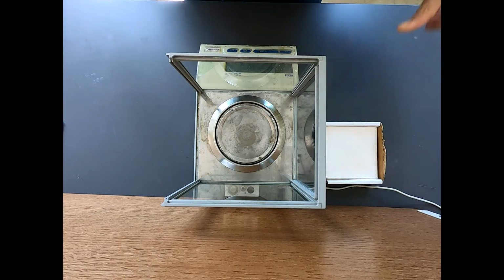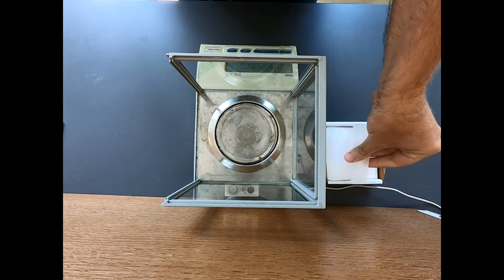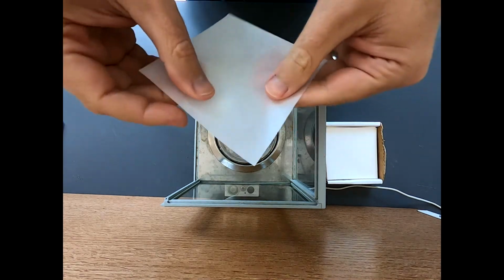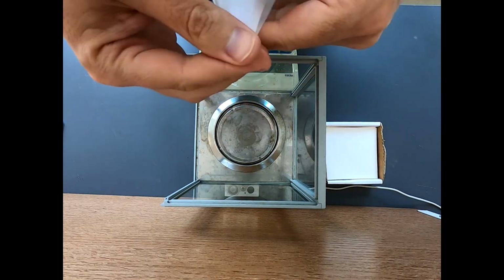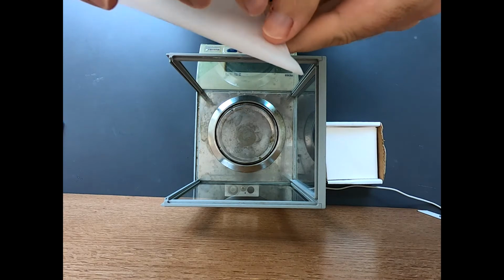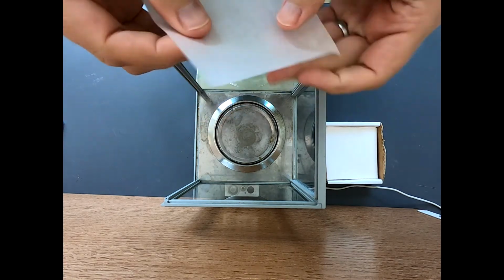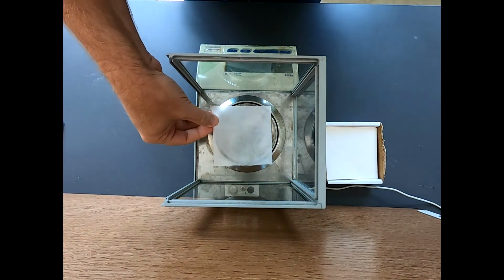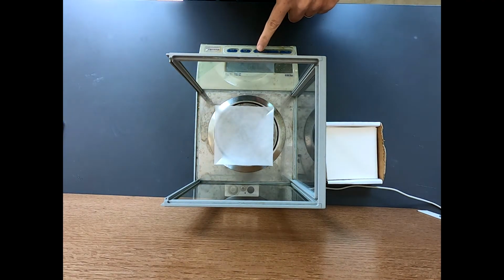Alright, let's get started with this reaction by weighing out some of our reagents. So I'm going to begin with the cycloadduct. I want to make sure I use a little bit extra of the cycloadduct. Now I know the cycloadduct is precious, but I would rather deal with having excess cycloadduct than the hydrazide.